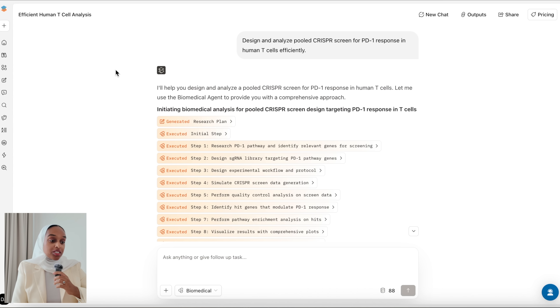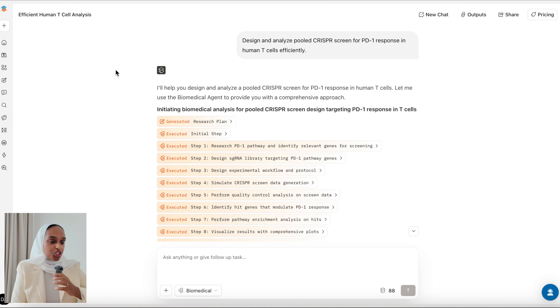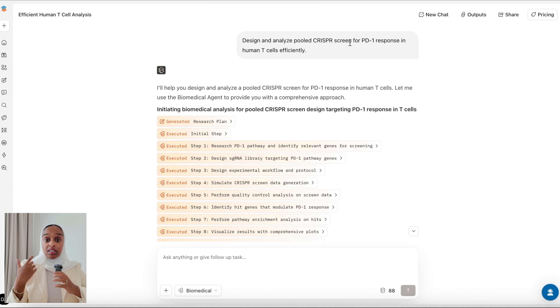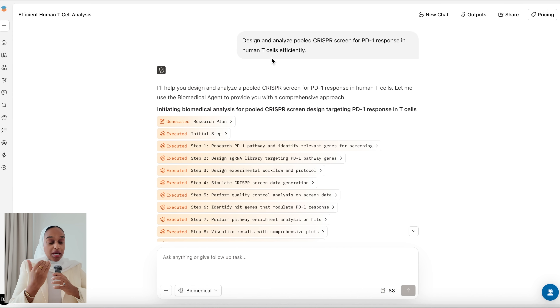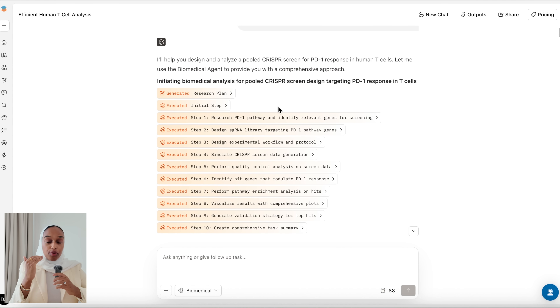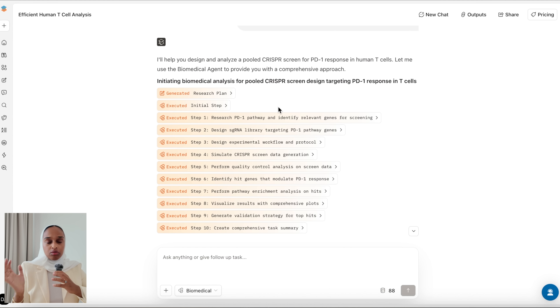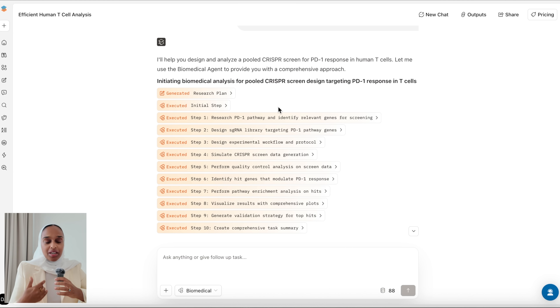The first prompt I asked was: design and analyze pooled CRISPR screens for T-cell response in human T cells efficiently. It does take a couple of minutes to get through this because it's an agent running through a number of steps, but you can just let it go and come back a couple of minutes later.